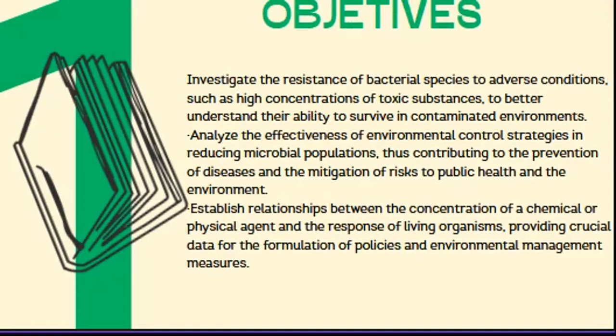The principal objectives of this investigation are to investigate the resistance of bacterial species to adverse conditions such as high concentrations of toxic substances, to better understand their ability to survive in contaminated environments. They analyze the effectiveness of environmental control strategies in reducing microbiological populations. This contributes to the prevention of diseases and the mitigation of risk to public health and the environment.